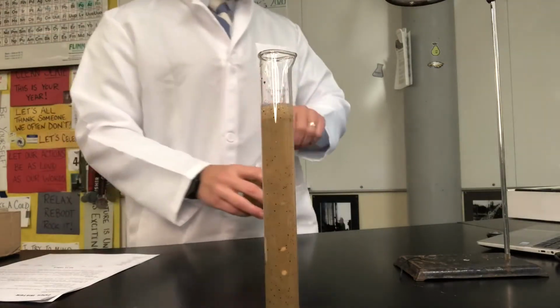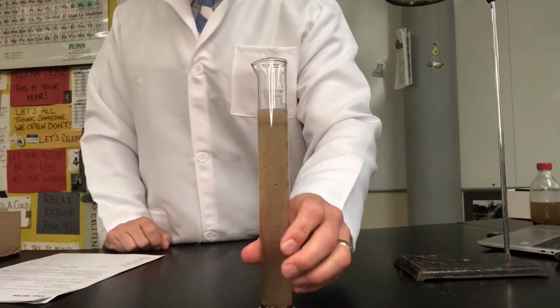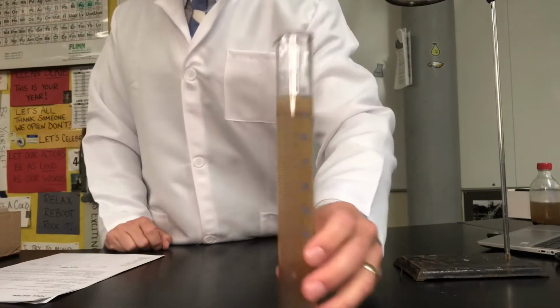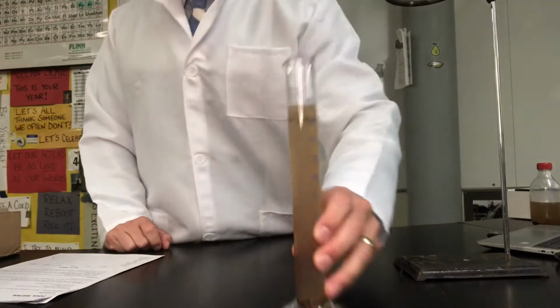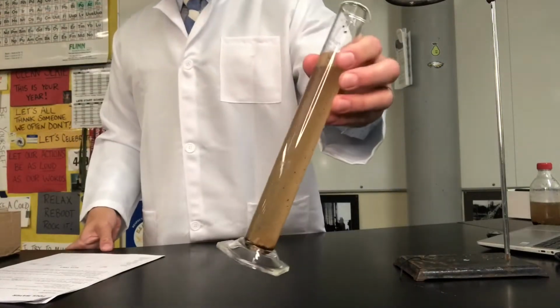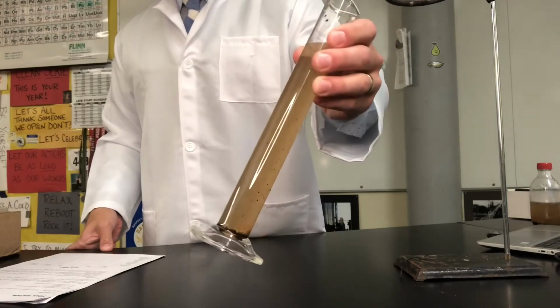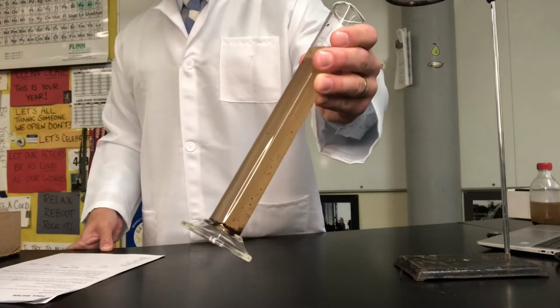Perfect. So, looking on your lab write-up in the data table, first thing we can do is start by saying that we have 100 milliliters of our foul water. Go ahead and write that down. Now, the color, you can take a look at it, but it looks like a brownish, beige, yellow kind of color to it. Definitely dirty.